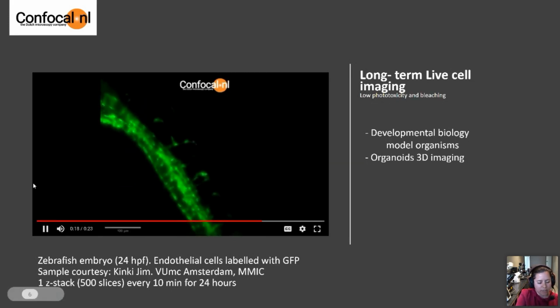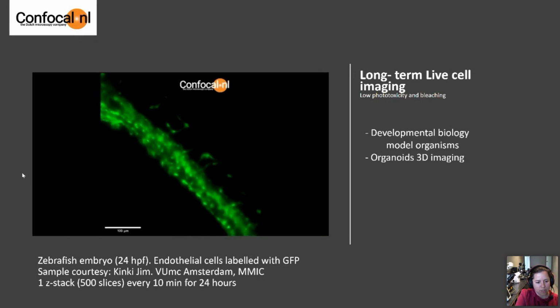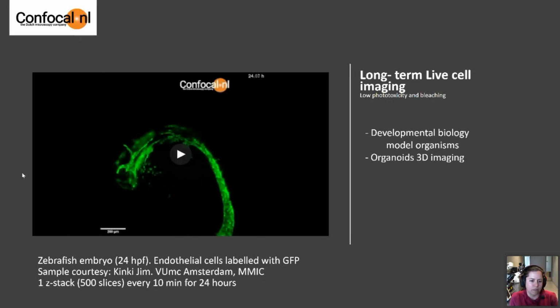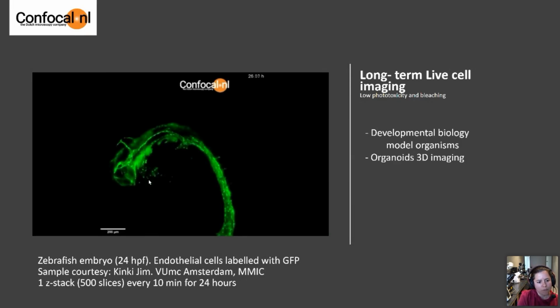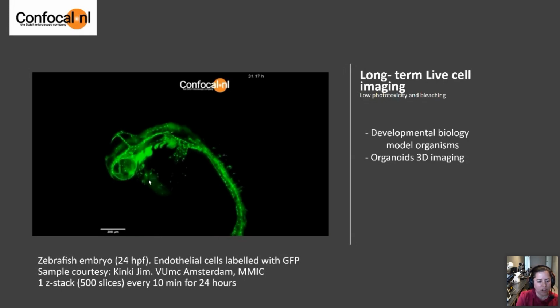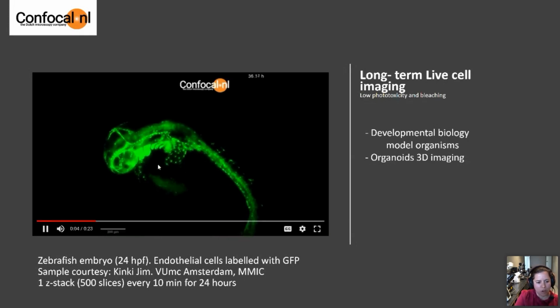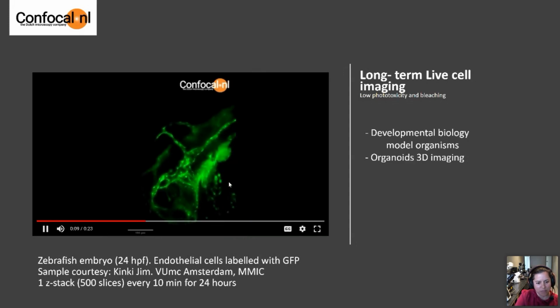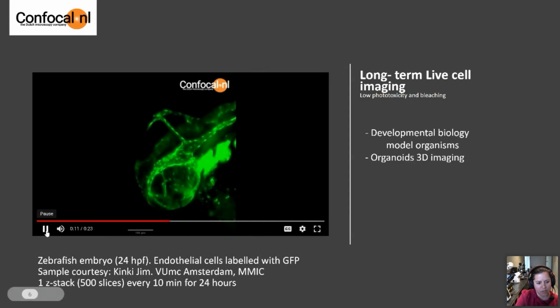So each z-stack is 500 slices, and you can see that the embryo is really not affected by phototoxicity. You can even see the development of the heart, and how cells migrate. It's a very nice video.